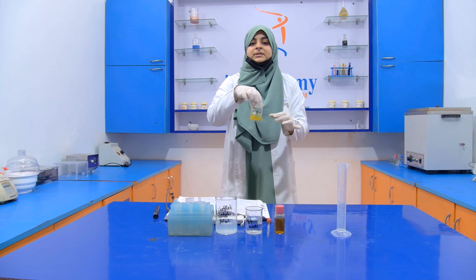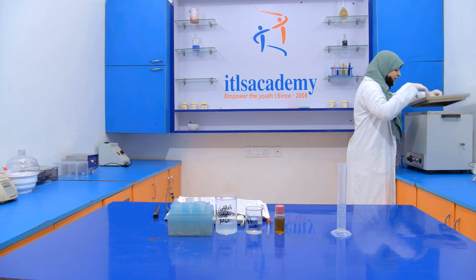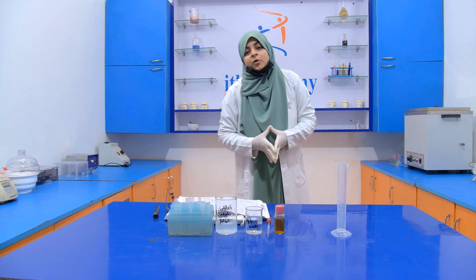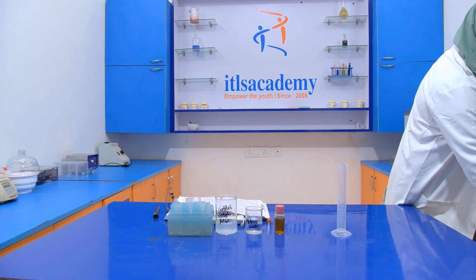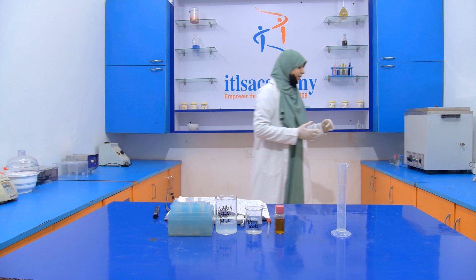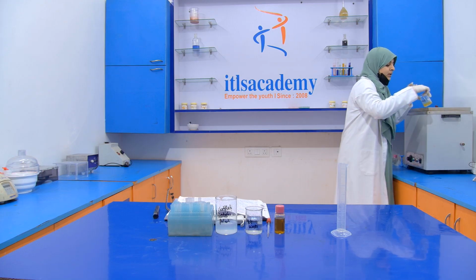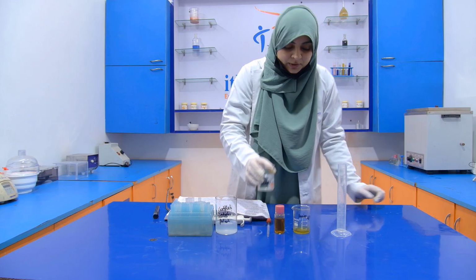Now keep this beaker inside the water bath for 15 minutes. Now we will see the result after 15 minutes. Then after that we add 10 ml of hot water. If turbidity is formed, it indicates that mineral oil is present. Now after 15 minutes, I am going to take the beaker out of the water bath and see if there is any turbidity. Then I am going to add the 10 ml hot water, and then we will see whether there is any turbidity or not.